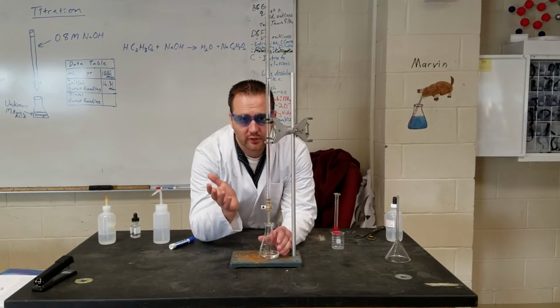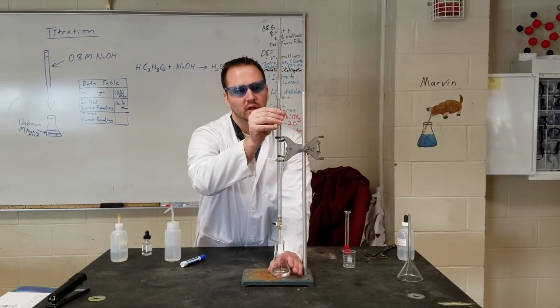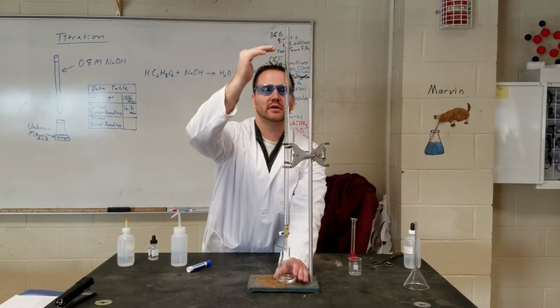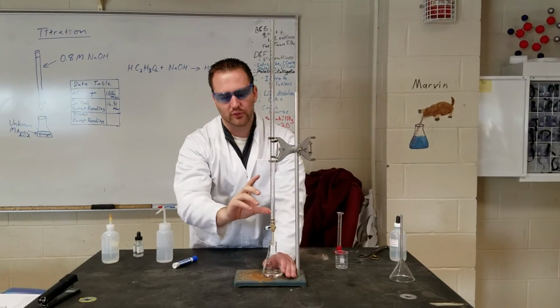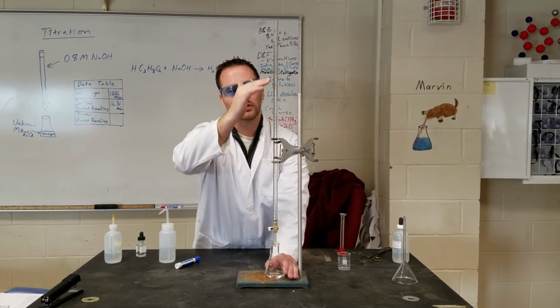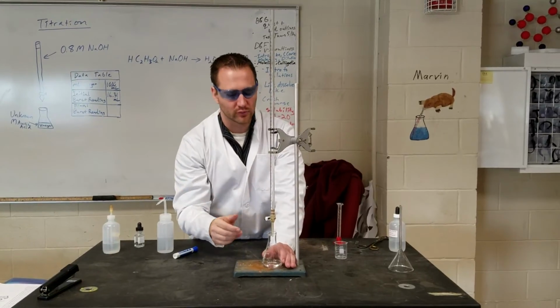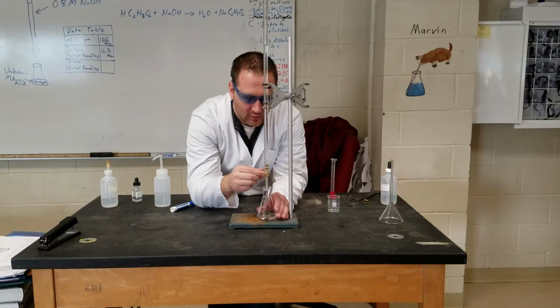Alright, so now we're ready to perform our titration, and I've recorded an initial volume in the burette of 16.3 milliliters. And something to just point out is the top reading on this burette is 0, even when it's filled and is loaded with 50 milliliters. So it counts down. So my volume is going to increase, but really I'm just looking at the difference between the two levels.